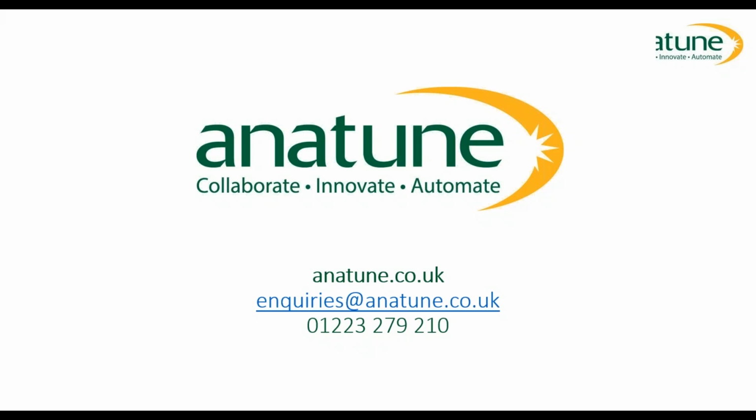Let's say we're looking at headspace, for example. One of the things you want to do is maximize your headspace concentrations or understand your equilibrium concentrations in the headspace. Now, we can do headspace measurements so much faster than you can do with GCMS. So you could set up a method to vary, say, incubation times or temperatures in an automated system and get the answers out from SIFT-MS to show you, broadly speaking, the analytical space you're in, and then use that data for the incubation time and temperature back in another method such as GCMS, and then do your separation. So there is a complementarity here. I think you could definitely do it. It would aid with your method development times, absolutely.